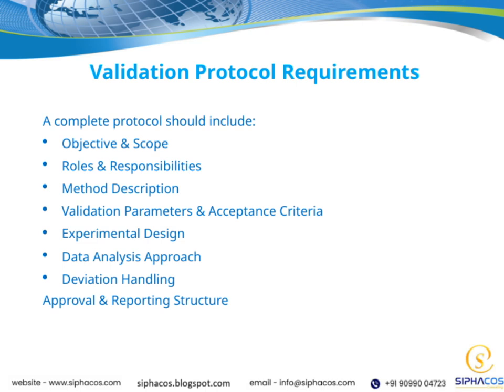Finally, we have the approval and reporting structure, detailing who approves the protocol and how the findings are documented and communicated. All of these elements collectively form the backbone of a robust validation protocol, aligning with our overall theme of ensuring quality and compliance in our processes.